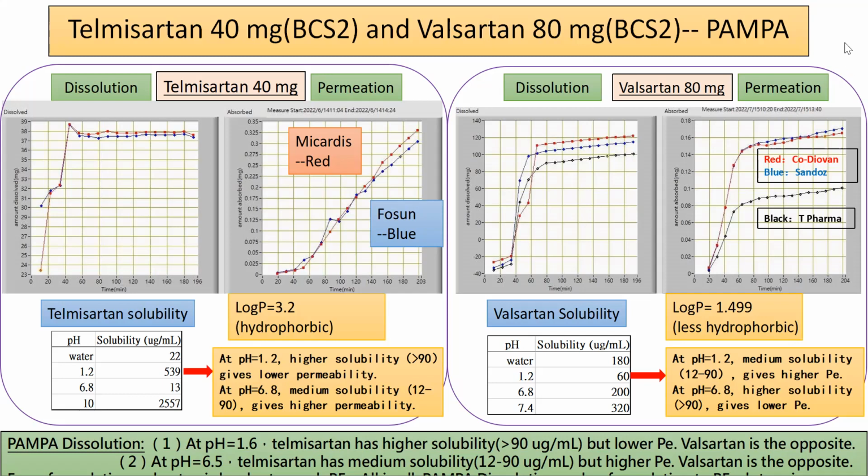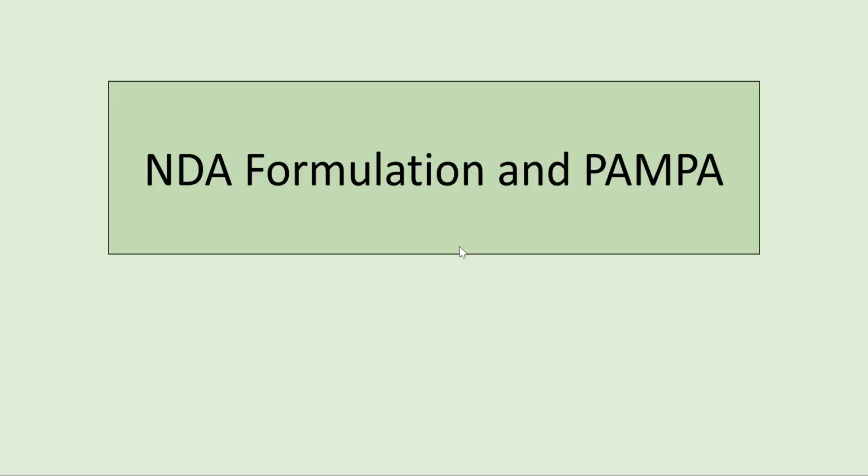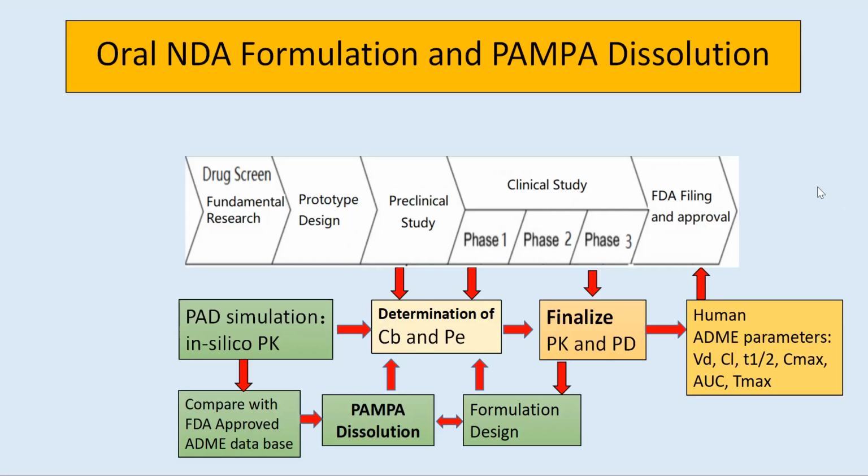Okay, so in addition to this generic drug demonstration, now let's come back to this NDA formulation with PAMPA. As you can see from this upper graph, it shows the NDA process, right? And what's interesting is that this PAMPA dissolution is introduced to help this preclinical to clinical in a way that we initially need the PAD simulation that's required by FDA.